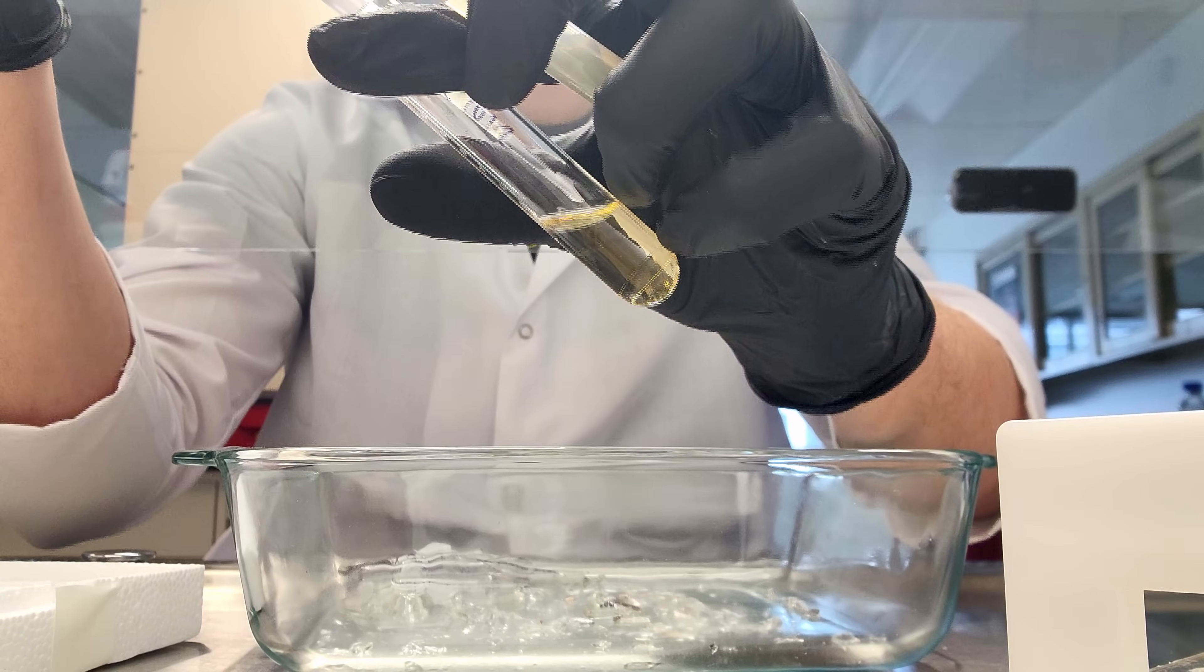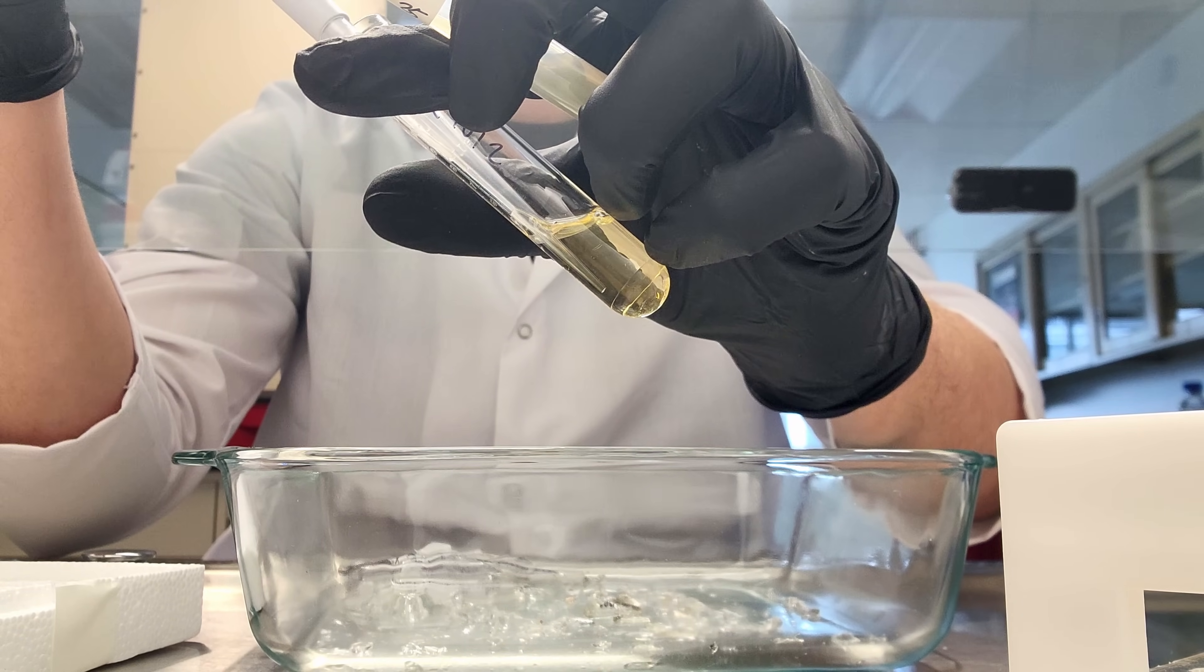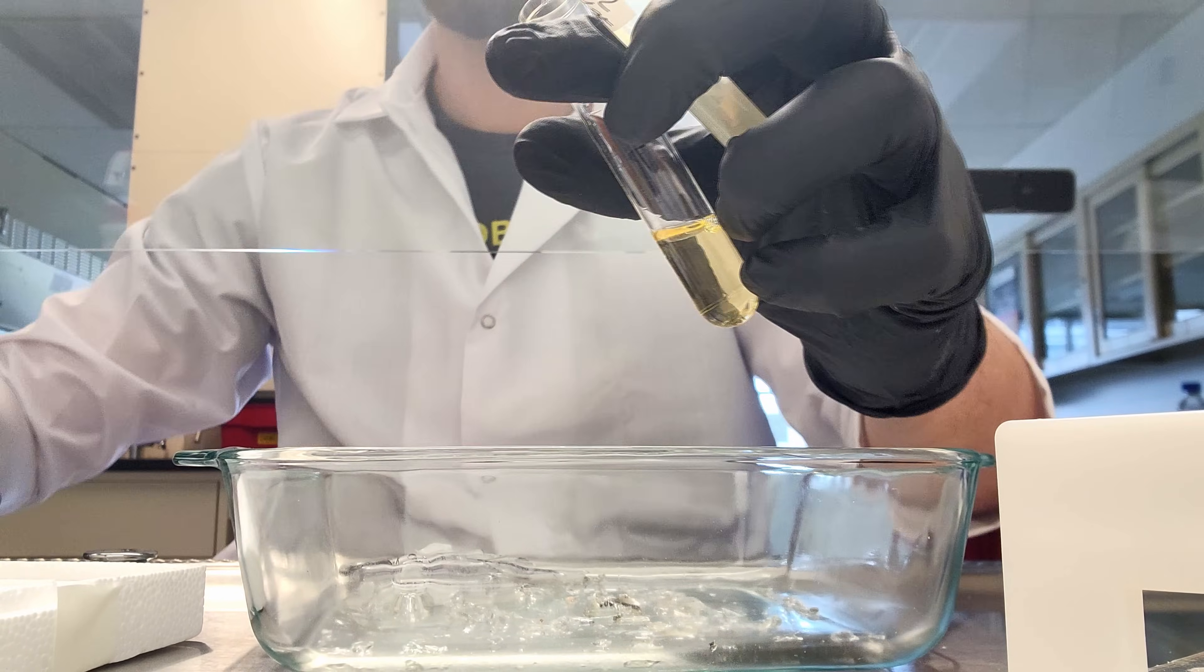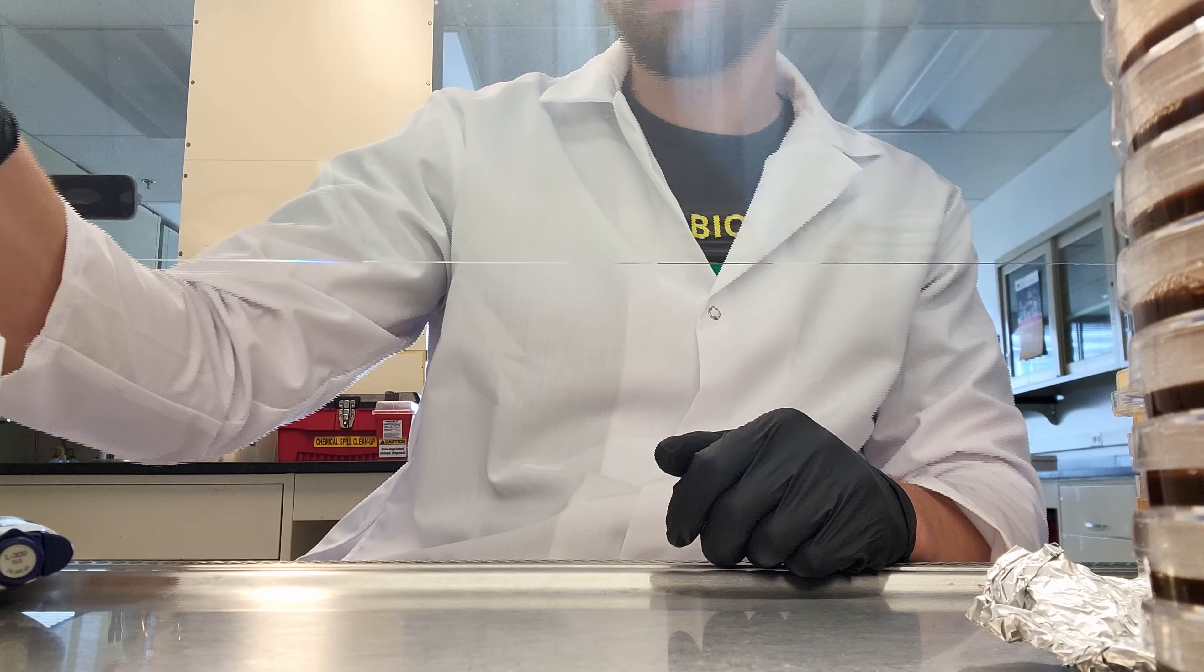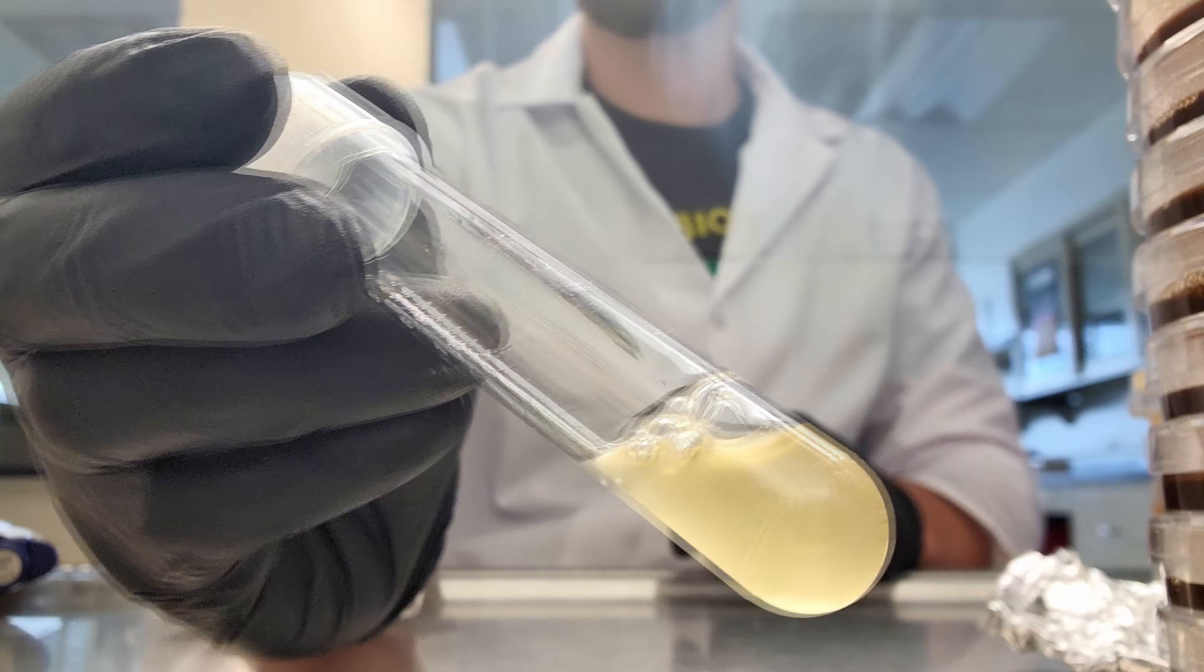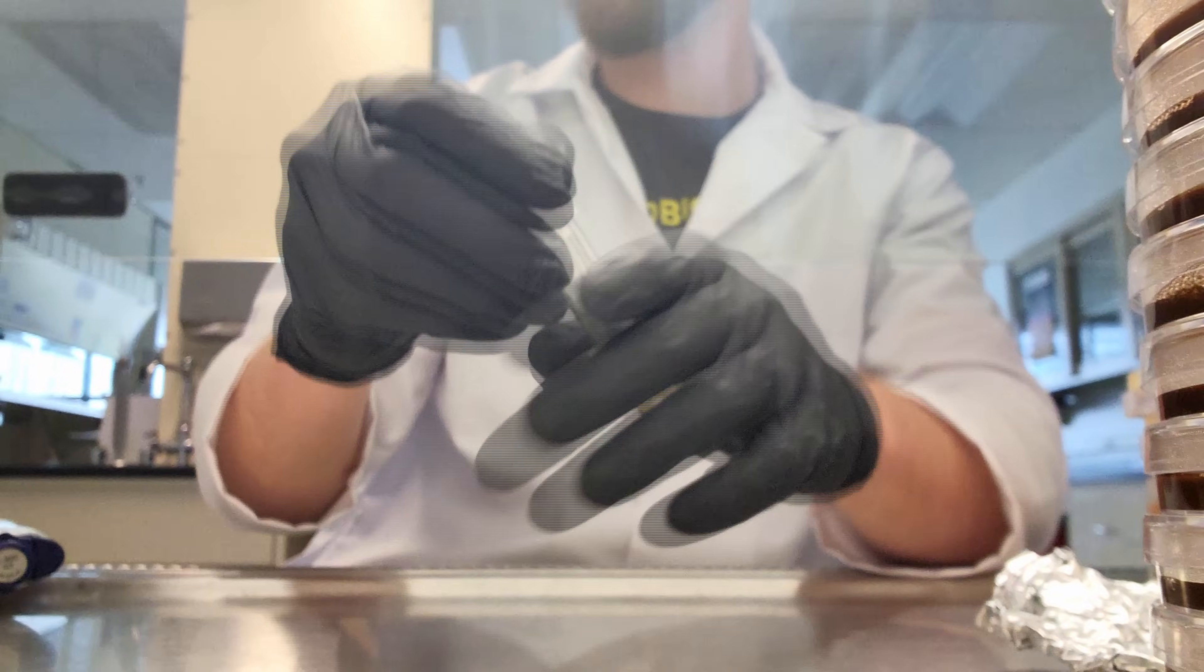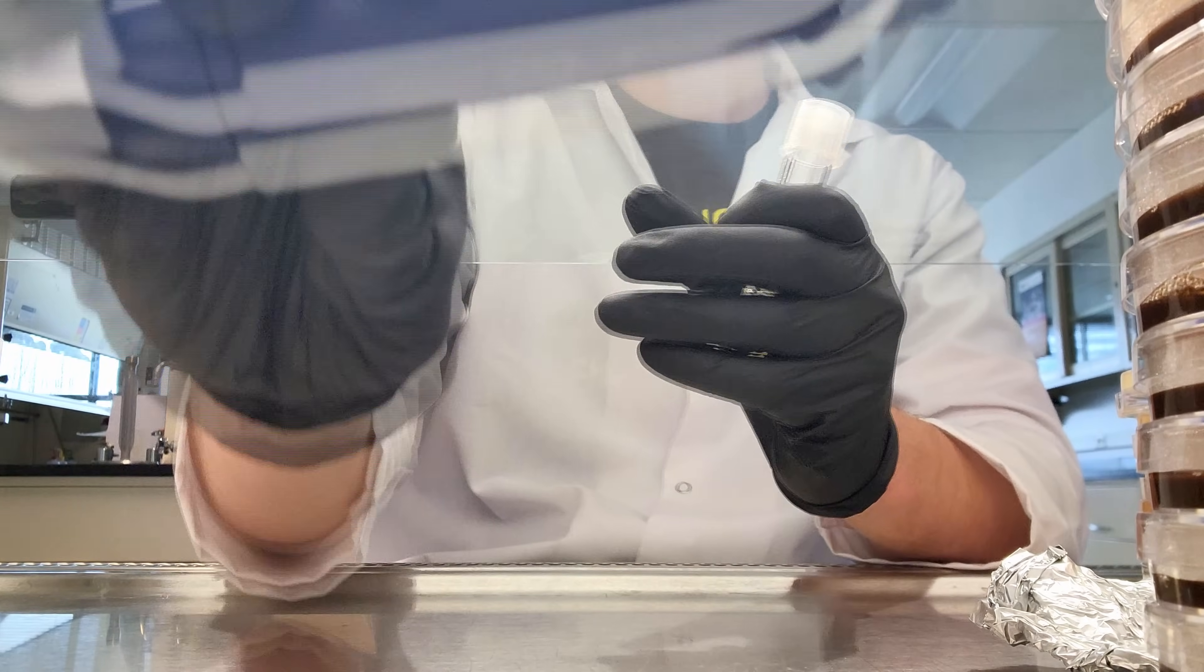So I put liquid into the slant culture, took the liquid back out, and then put it in the YPD liquid culture. Now in all of these liquid culture tubes, these have not grown for any amount of time—I just put the cells in there. We're going to use those cells, or use that liquid culture hopefully with the cells, to make our streak plates.